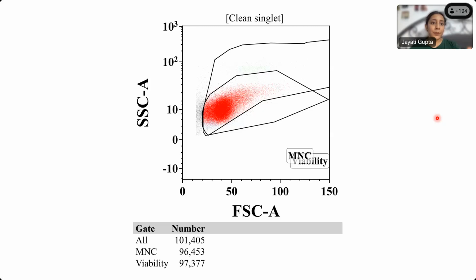So yeah, there are two things. You have perfectly said forward scatter and side scatter. Forward scatter is telling you the size. The second thing it is telling you is that normally you will have a lot of cells here. Neutrophils, which are high side scatter, have to be there. So this is actually mirroring what we saw in the morphology, that there is a uniform single large population of cells. So both are correlating. So this red population, a single population, is there.